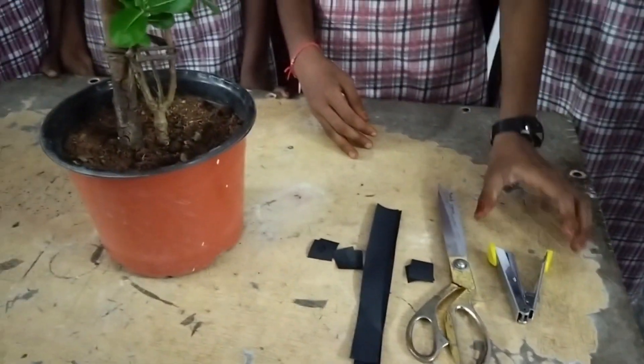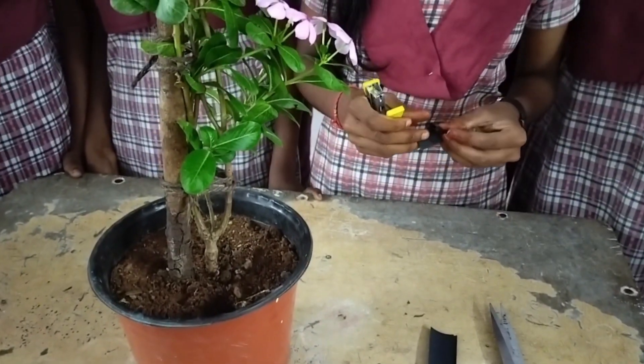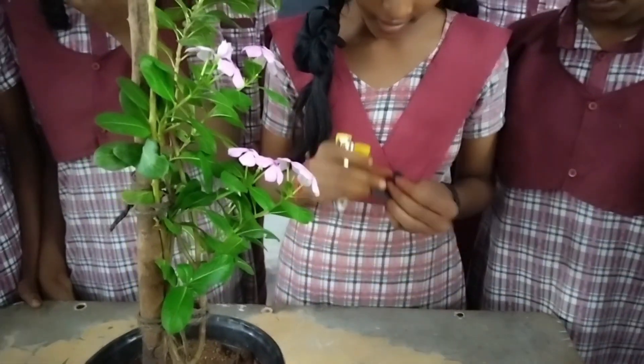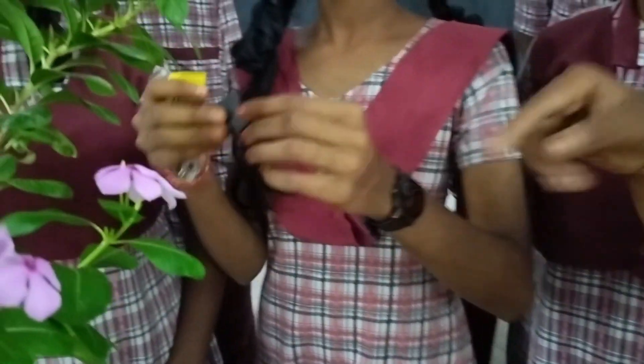First we kept the potted plant in a dark room for 3 days. After that we took this plant for the experiment. The plant is periwinkle.